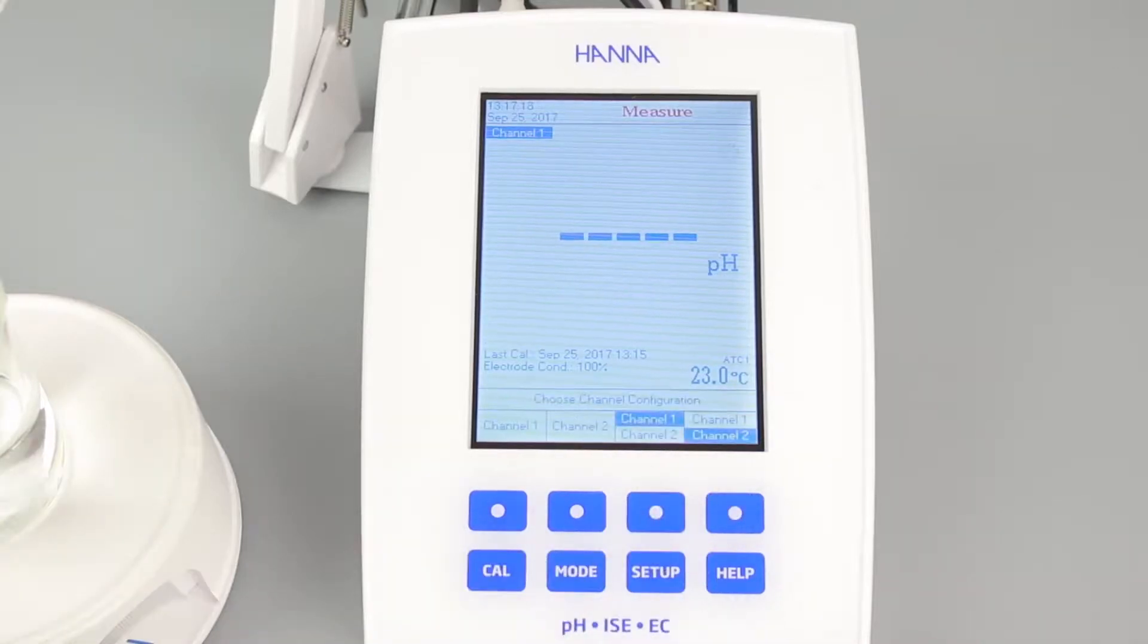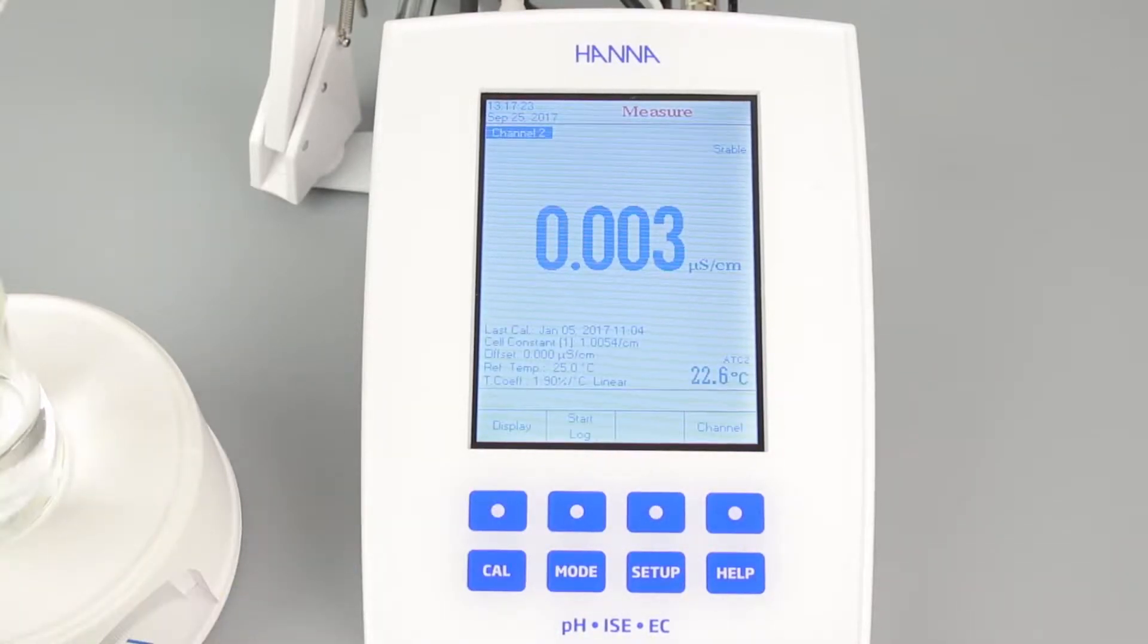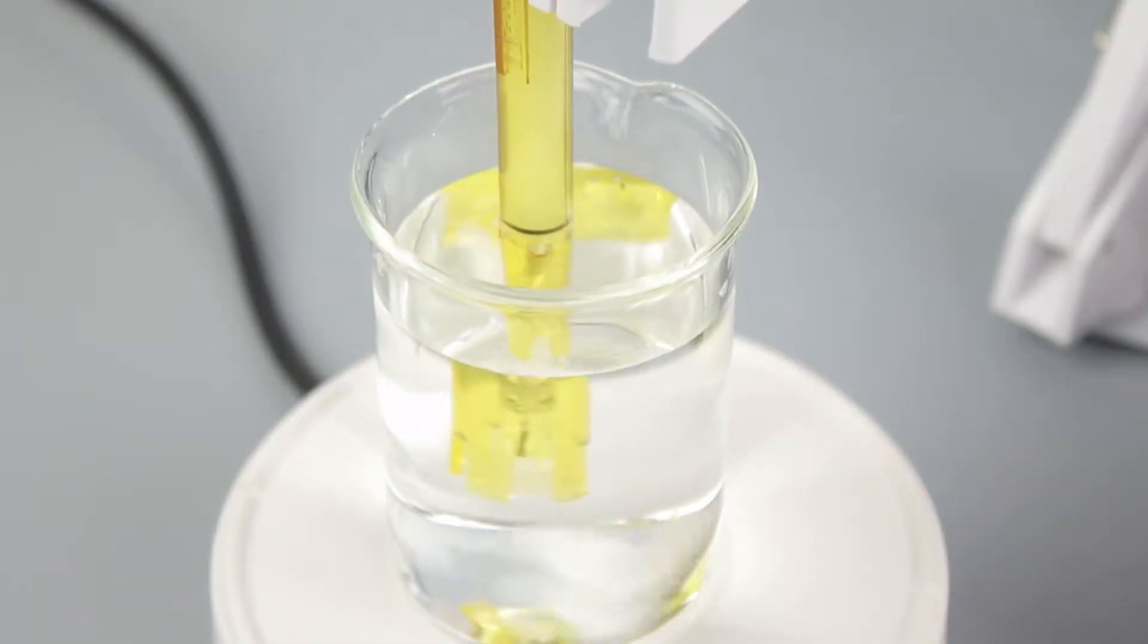To perform a conductivity calibration, access the EC channel by pressing channel, then pressing channel 2. Now press CAL to enter EC calibration mode. Submerge the EC probe in the standard of your choice. Be sure to rinse with standard before submerging the probe for best results.